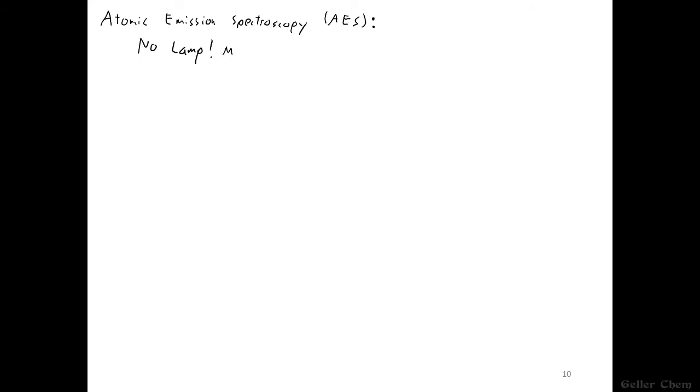So measure emission from relaxing electrons that were excited by the high temperature environment.